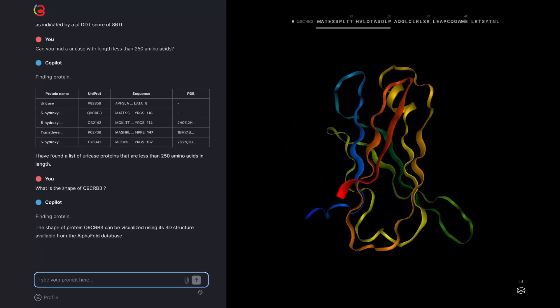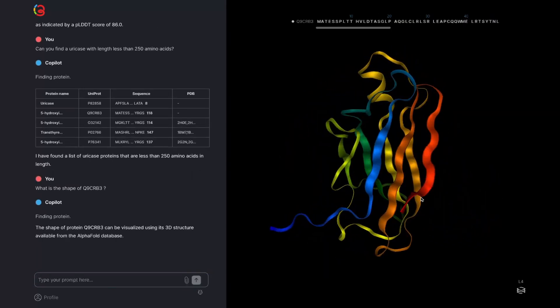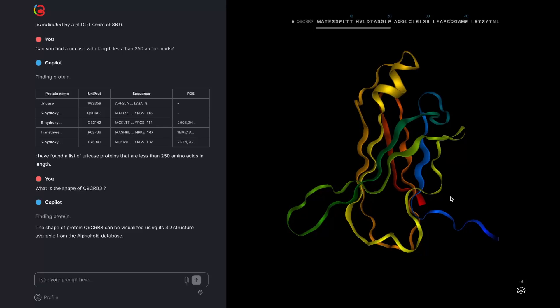In this case, because there's an AlphaFold database structure already available, Copilot returns that rather than recalculating the prediction from scratch.